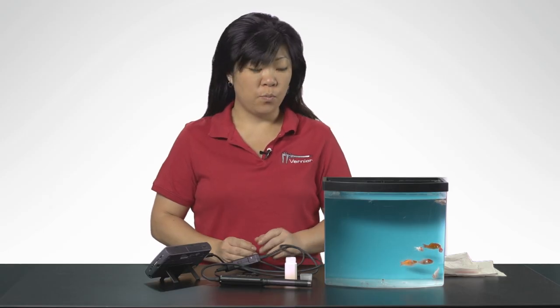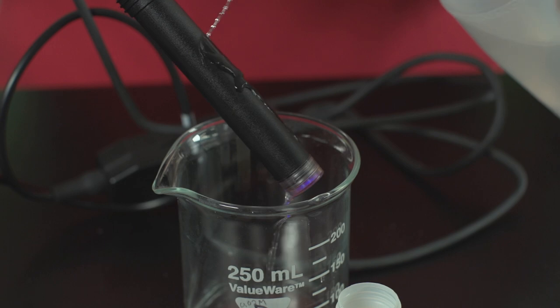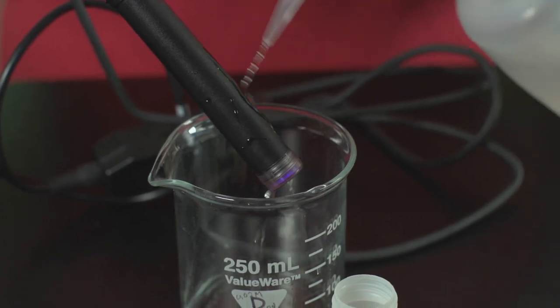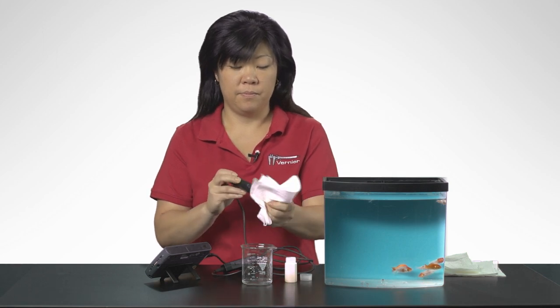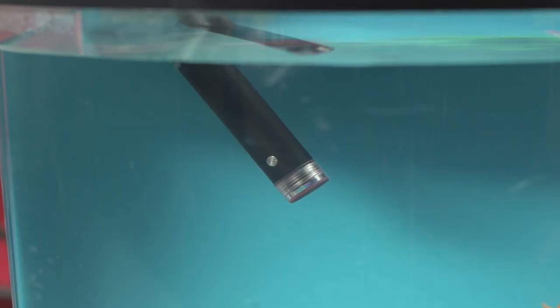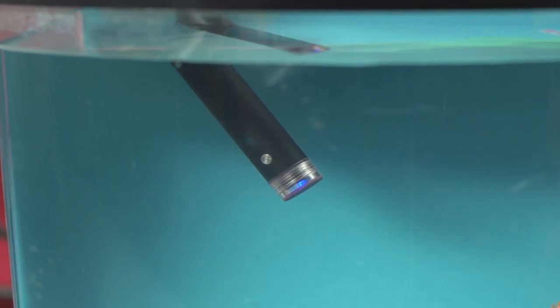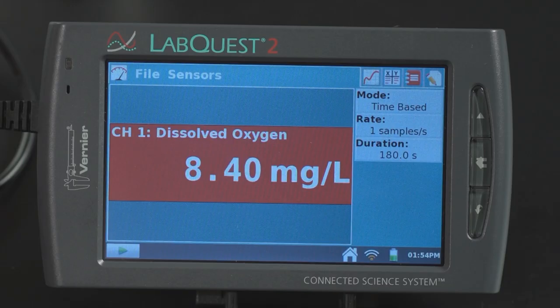To obtain measurements, rinse the tip of the DO probe with distilled water and gently blot dry with a paper towel. Place the probe into the sample to be tested. Make sure that metal dot near the tip of the optical DO probe is immersed for temperature compensation to work. If you are taking measurements at temperatures below 15 degrees Celsius or above 30 degrees Celsius, allow more time for the temperature compensation to adjust and provide a stable reading.